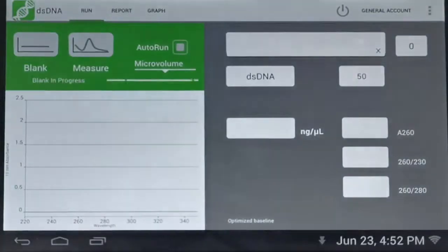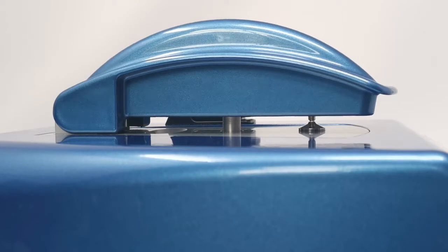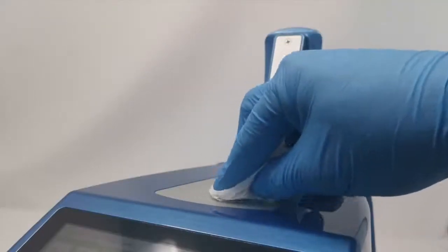During this blank cycle, you'll hear the light firing, and the arm will move down and take the blank at various path lengths, and it stores that and uses that as a reference spectrum when we measure our sample. So we correct for anything that's in your blanks. You're just measuring exactly what is in your sample. It just takes a couple of seconds, and you'll see that when it's finished, the measure button becomes active, and all we do is we wipe the blank away.